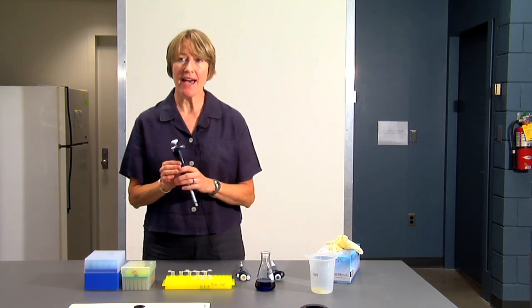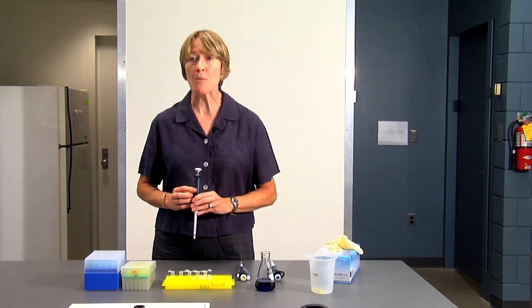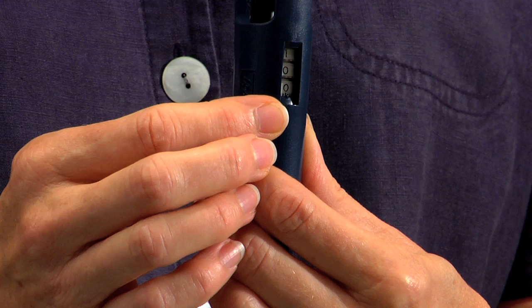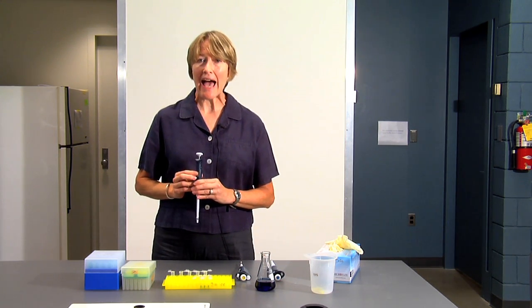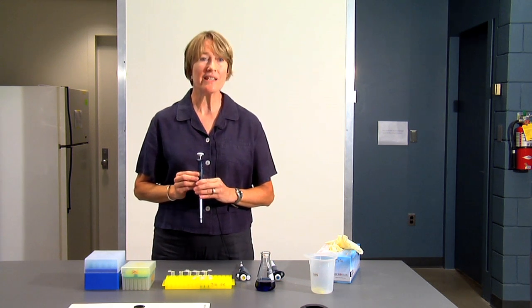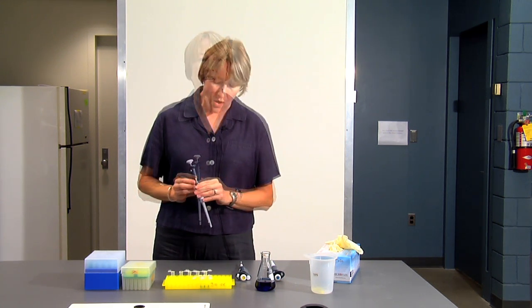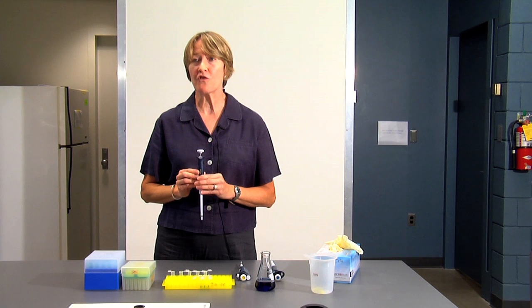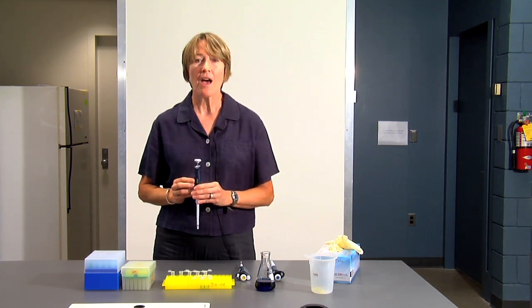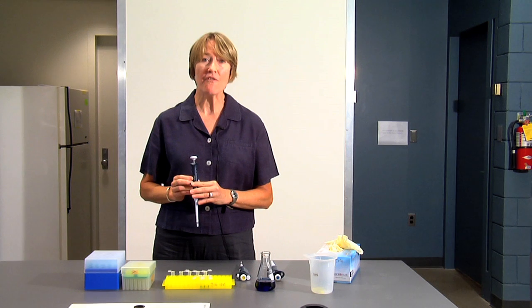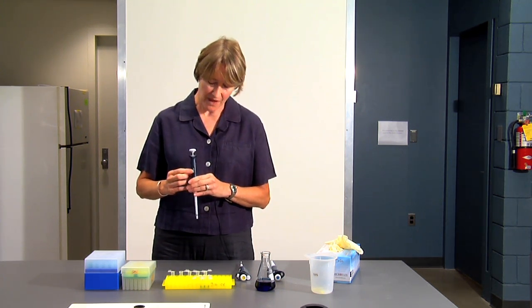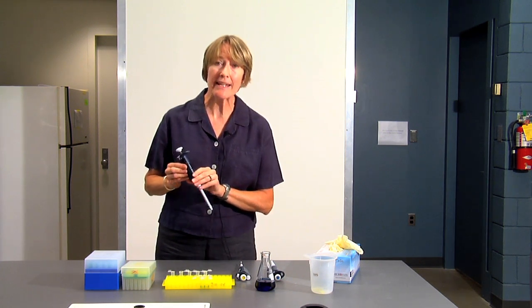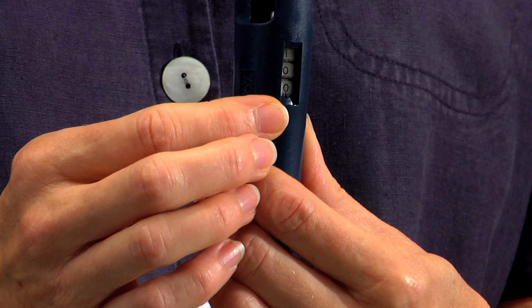Each of the pipetters has a series of three numbers on the barrel, and this is how you set the volume that you want to use. Some of the numbers are black, and some will be red. The red numbers indicate that you have to be alert. We'll start with the P200 first because that's the easiest one to set. On the P200, you have three black numbers on the dial, and essentially what you see is what you get. If the pipetter is set at 100, that will measure 100 microliters.